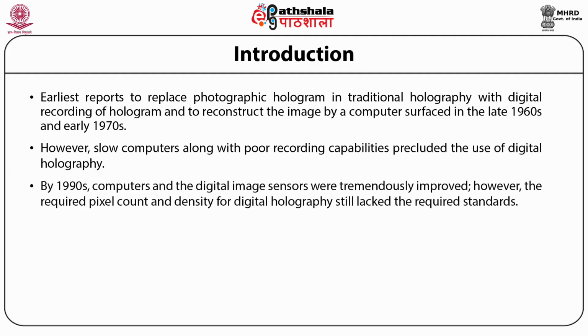By 1990s, computers and the digital image sensors were tremendously improved. However, the required pixel count and density for digital holography still lacked the required standards.